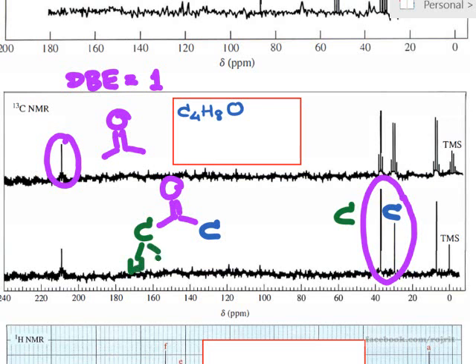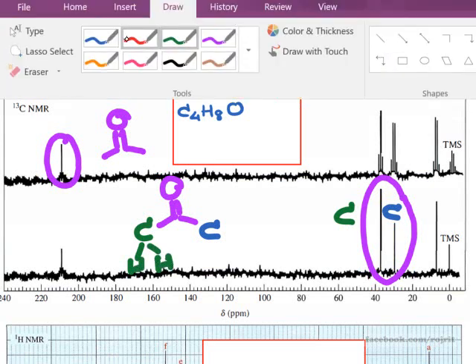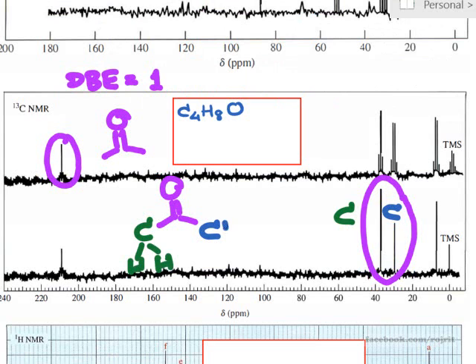For the green carbon, it is 2 hydrogens because it's a triplet, right? So we know that this is CH2. But for the blue carbon, it is a quartet. So if it is a quartet, this is CH3. And then we have, again, CH3 in pink color over here because it is a quartet. So we have only one carbon left, right? So there is only one possibility. You have to put the CH3 in pink color here on the left hand side. So this is it. So the molecule here is butanone. Okay, that's the first example.